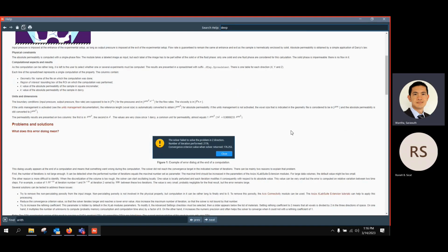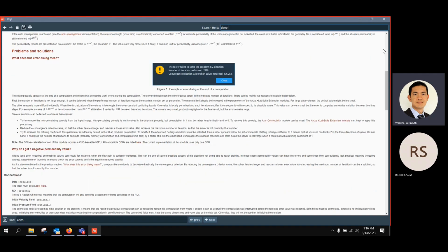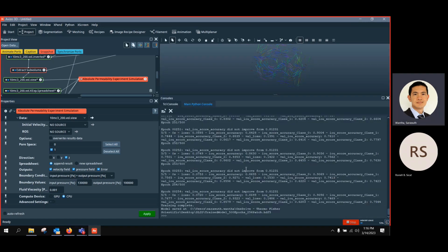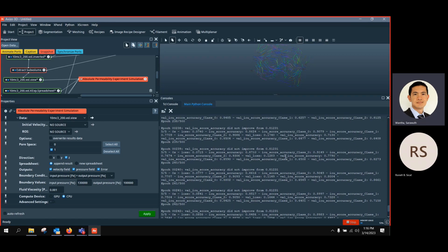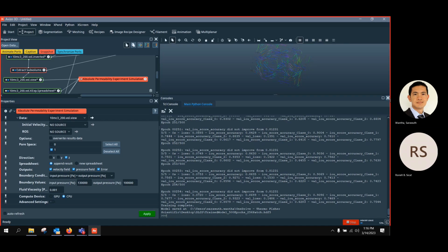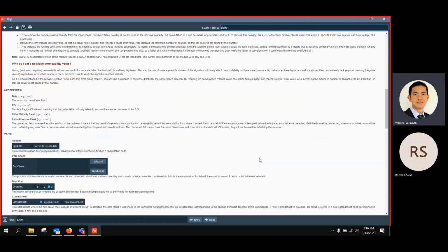They have some background information on how they run, but I'm not sure if they really give you the code. But what you could do here, we have a Python console. Yeah, could be. No, this is from deep learning. Yeah, probably. I will get back to you on this question as well because I'm not sure if we really provide the code for this simulation.